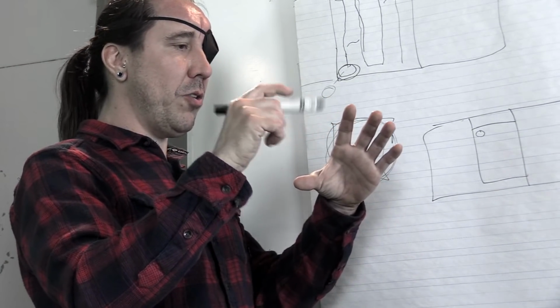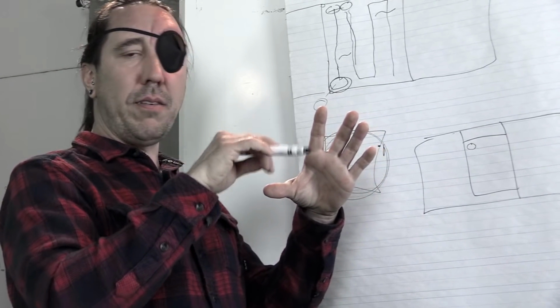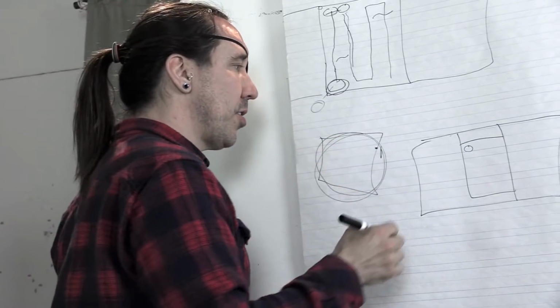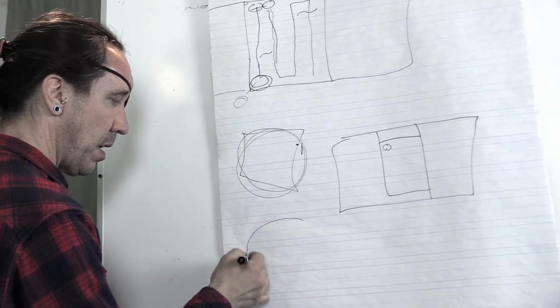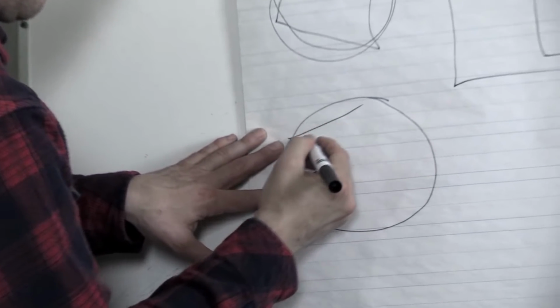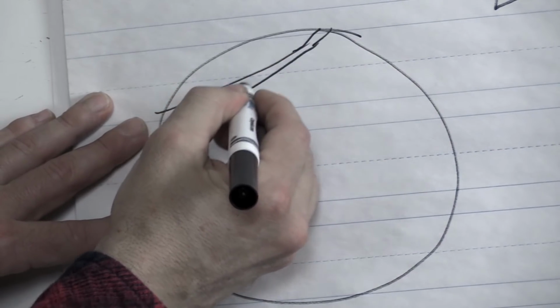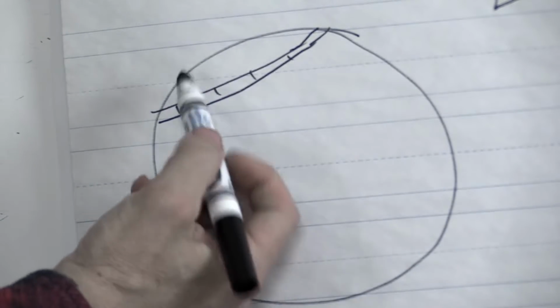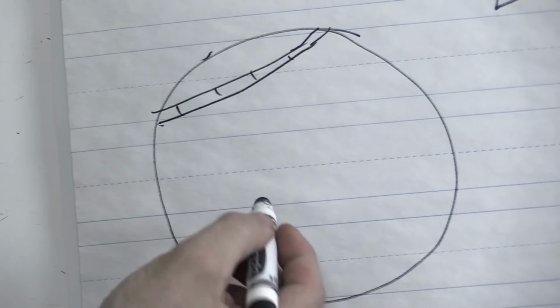So we're going to look in that field of view for testate amoeba, naked amoeba, fungi, ciliates, flagellates. So we've stopped here. And we notice a fungal hyphae up here. So we can make a note of that.